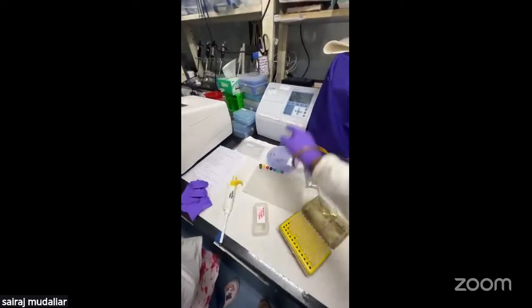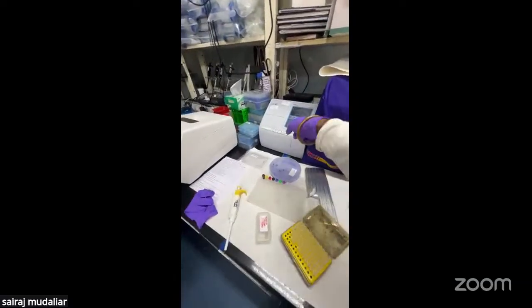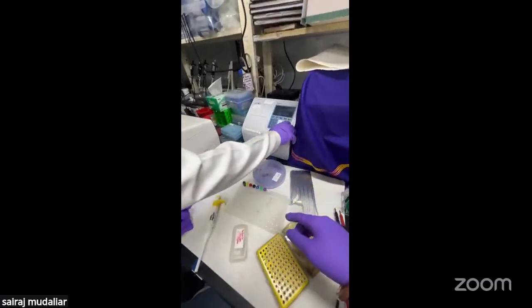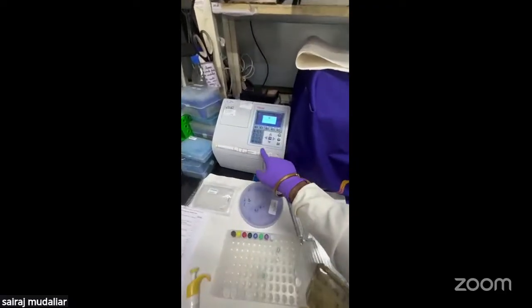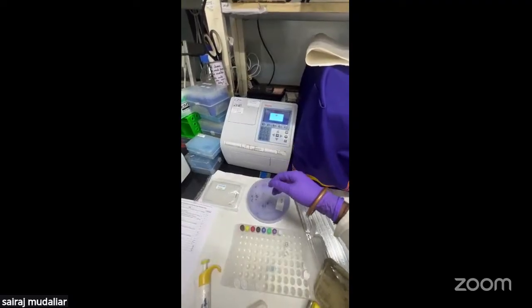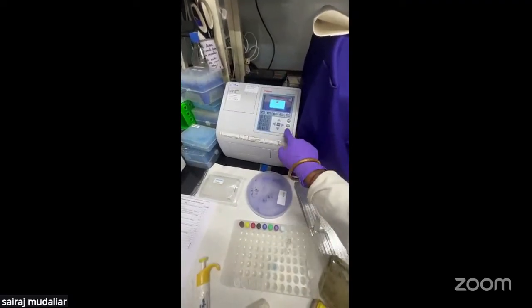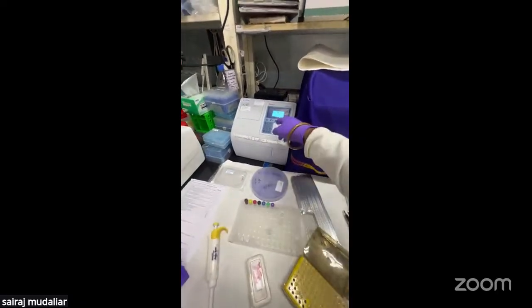we'll do the peptide quantification. So this is a plate reader, what you are seeing. Open this.